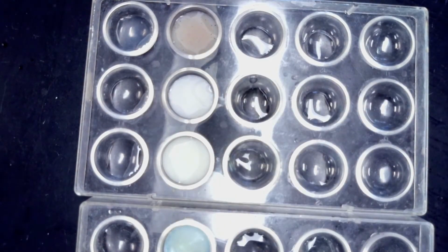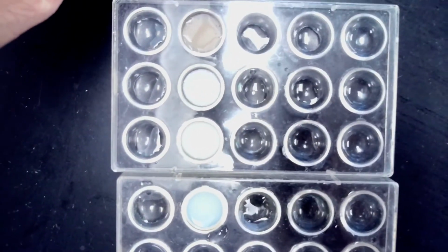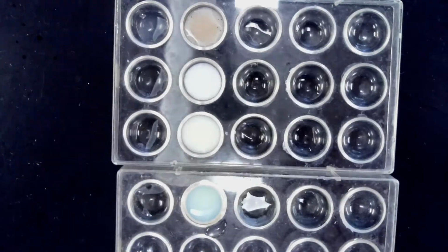And then after adding the ammonium hydroxide, the first one kind of disappeared. That bottom one cleared up a little bit, but not much. I would say no reaction there.